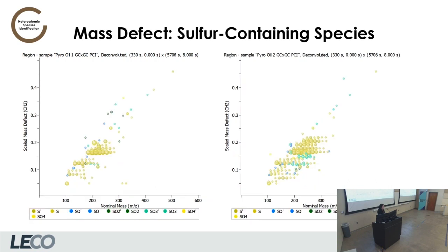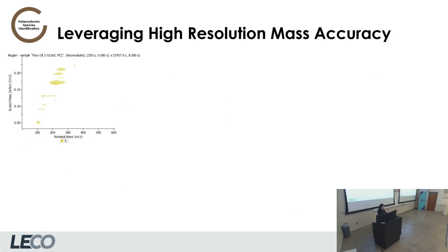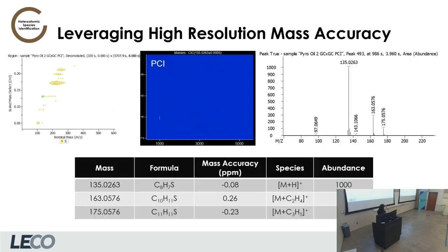And so when we look down at the different types of sulfur peaks we can get, so these are all mass signals, right? We can take specific mass signals from the mass defect plot back onto our chromatogram to see if they correspond to any peaks, and then get identifications of what is contributing to this sulfur hit in your mass defect plots. All of those different puzzle pieces together allow us to get better identifications of individual peaks. So you can get that speciated information, as well as that bulk characterization just from how big your blobs are on the mass defect plot or on your chromatogram.